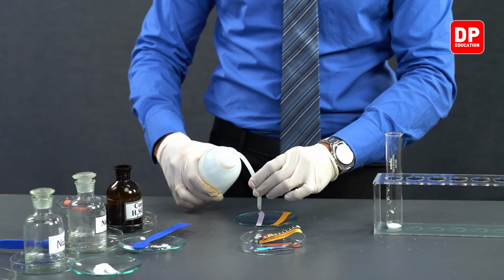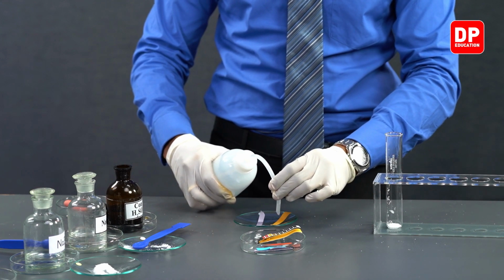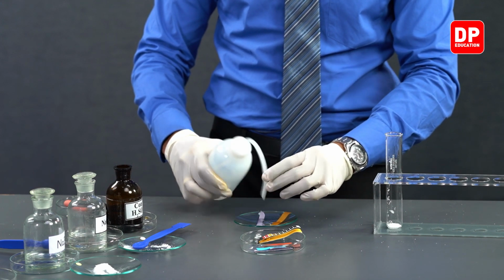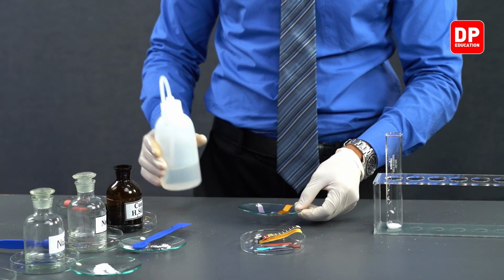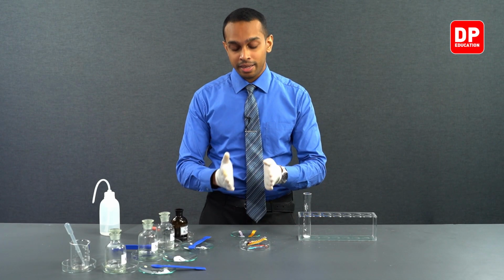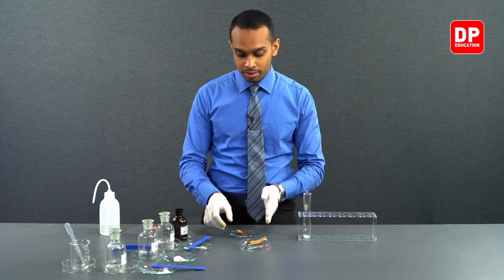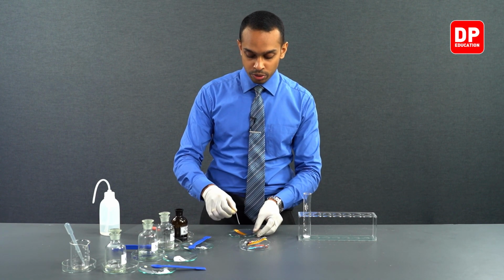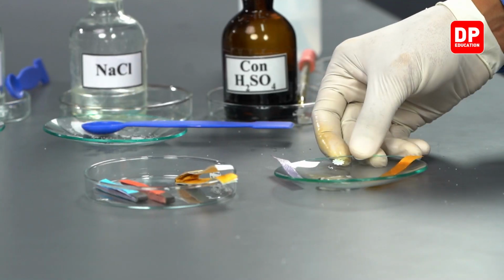The reason for adding a little bit of water onto these papers before we expose them to the gas is to make sure that the gas will adhere to these papers and dissolve in the water that is present on the paper and can show us a color change by having those gases coming into contact with the paper properly.